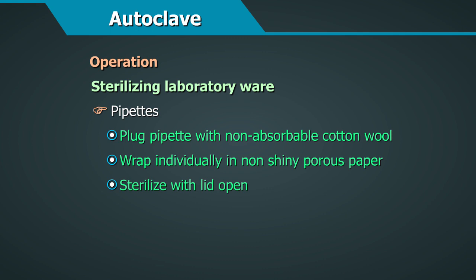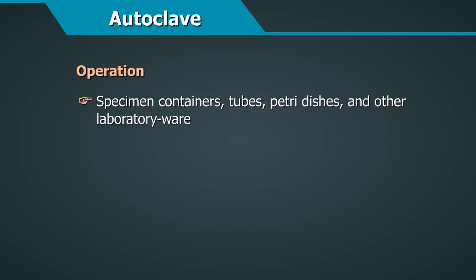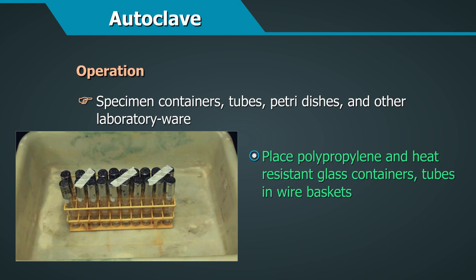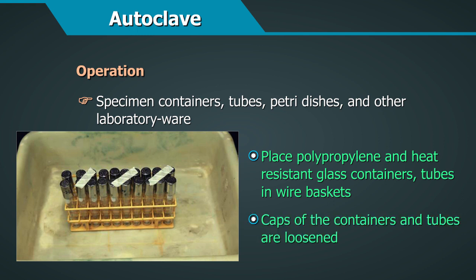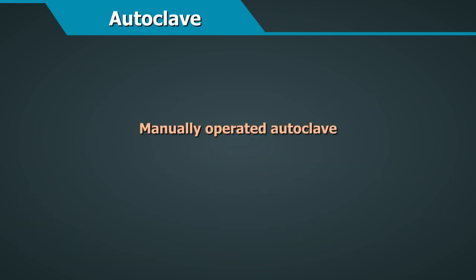For pipettes, plug glass or polypropylene pipettes with non-absorbent cotton wool and wrap individually in non-shiny porous paper, such as X-ray wrapping paper, or place in a metal or polypropylene canister, leaving the top off during autoclaving. For specimen containers, tubes, petri dishes, and other laboratory wear, place polypropylene and heat-resistant glass containers and items in wire baskets or suitable open-sided holders, ensuring caps are loosened when loading.